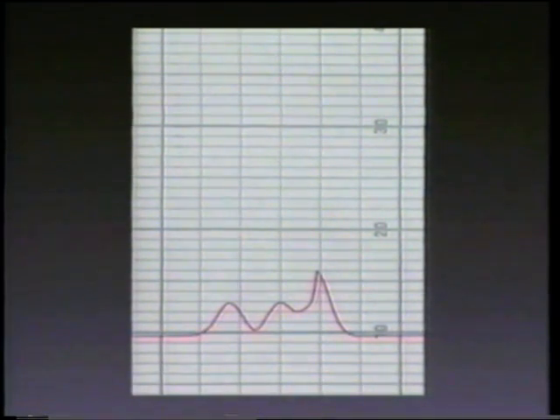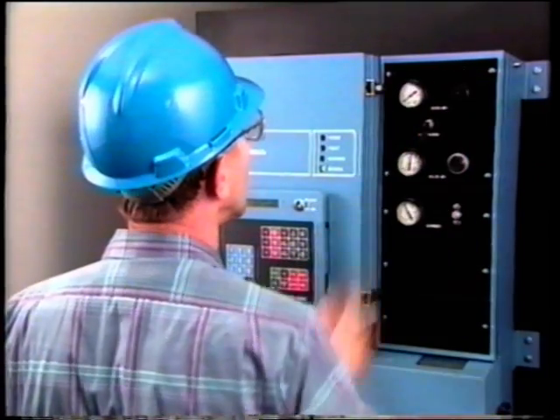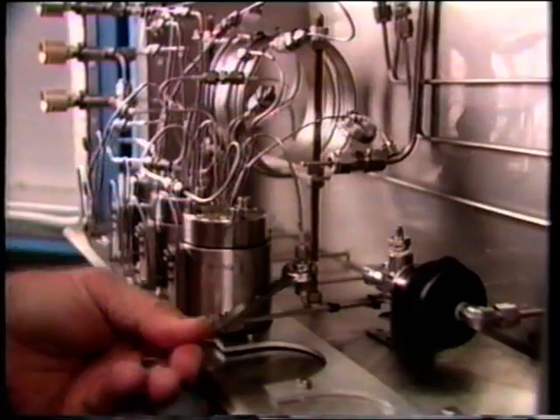Since testing for leakage requires opening the analyzer oven and disconnecting the valve, you'll need to shut down the system. To do this, turn off the analyzer. Block the sample flow control valve. Block the carrier flow and allow the oven to cool.